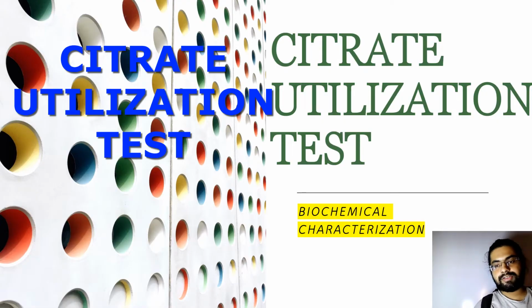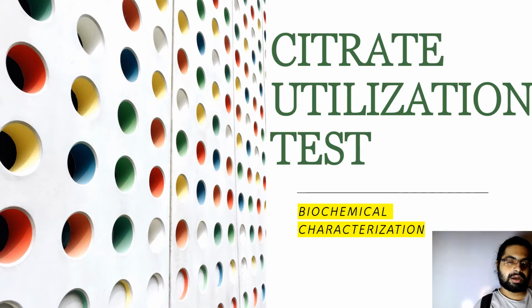Hello, in this video I will talk about a biochemical test that is used to characterize enteric bacteria on the basis of their ability to utilize citrate as the only source of their carbon.